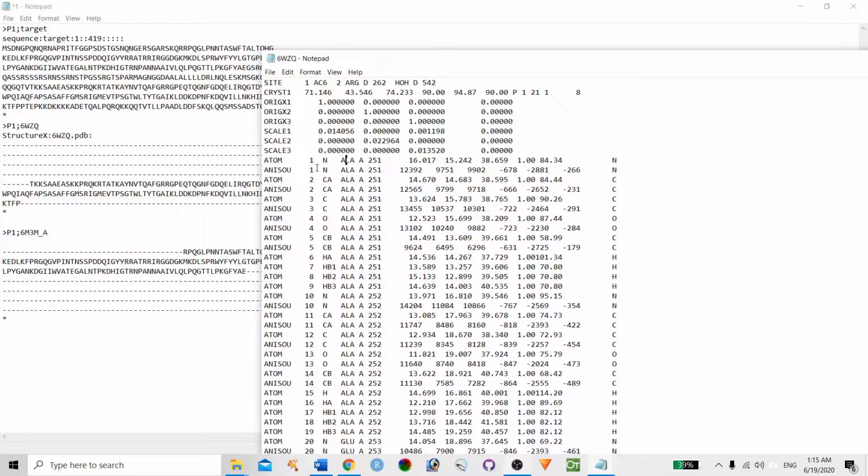Okay, it's threonine, not the alanine. So it means some amino acids are missing in the crystal structure. Don't worry about it, you will always find some missing residues in a crystal structure. So we have to do manual curation, we have to manually remove the amino acids.